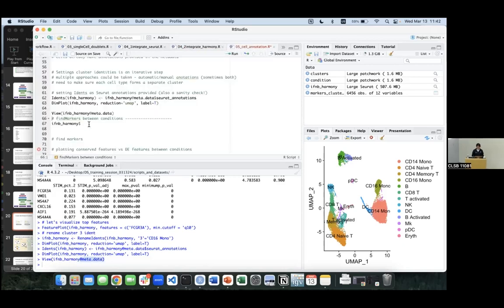There's one cell definition, created using paste0.